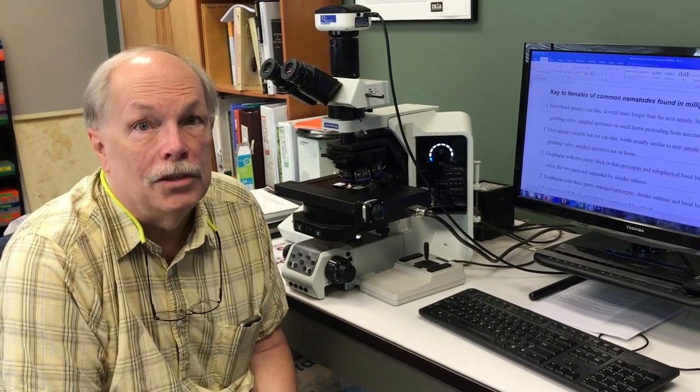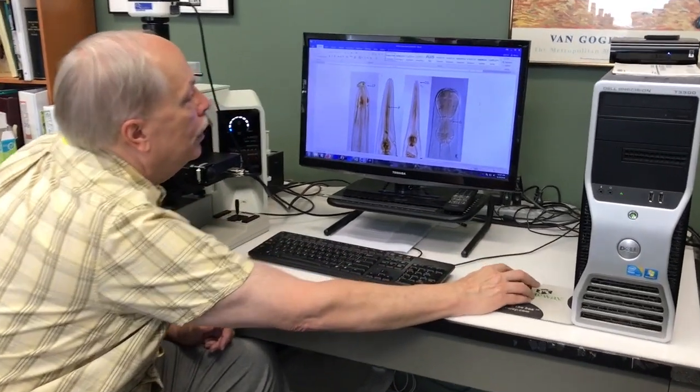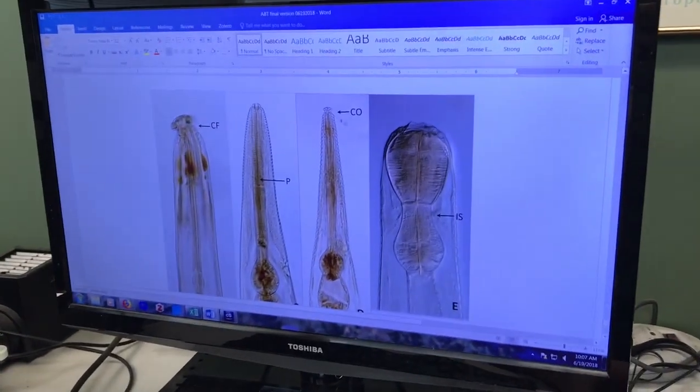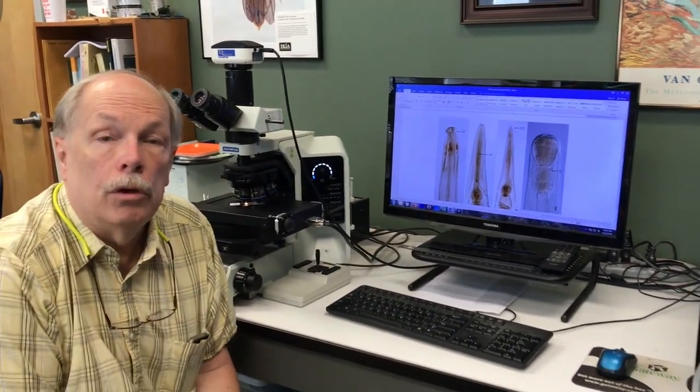Now we're going to look at a nematode that goes all the way to the end of the key so we can see all the characteristics we use for these nematodes here in Eastern Tennessee. We just identified Coronastoma easily, but now we're going to do a nematode that's at the end of the key. Before we do that, let's look at a little bit of the internal anatomy of the nematode because we're going to be using these terms, and once you see them they'll be pretty obvious. As we go through the key, I'll be pointing them out on the nematode we're going to be keying out.